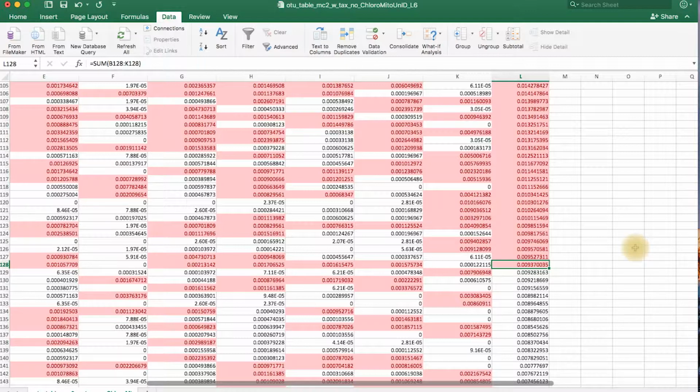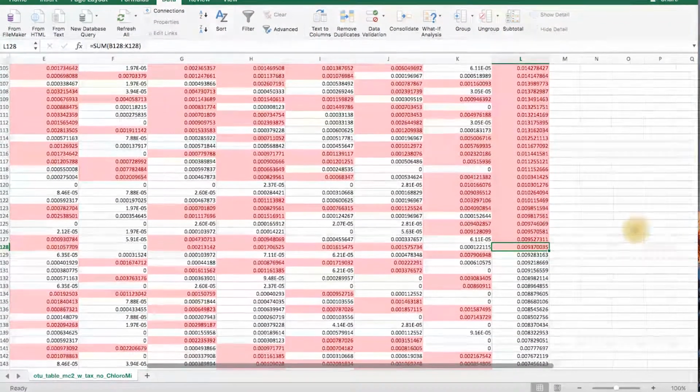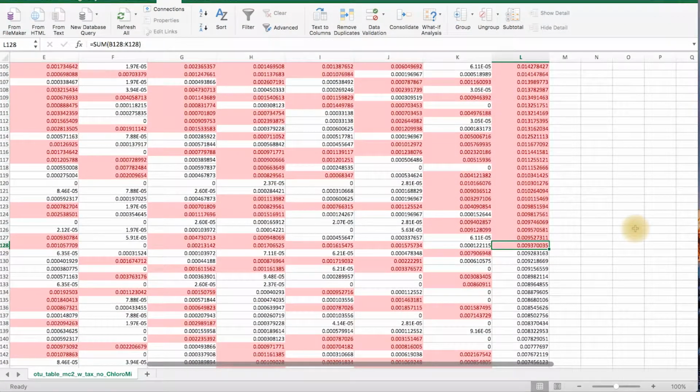To summarize, you learned how to find averages and counts using the statistics bar at the bottom of your Excel window. You practiced using the Sort and Conditional Formatting tools, and you learned how to apply the Sum function. You can now use these tools to identify trends across your entire project or within a subset of your project. For example, you can focus on a specific environment or sample type, or compare specific experimental samples to control samples.